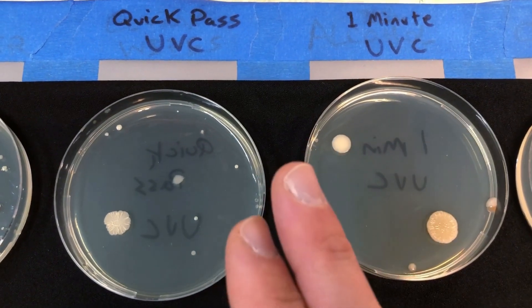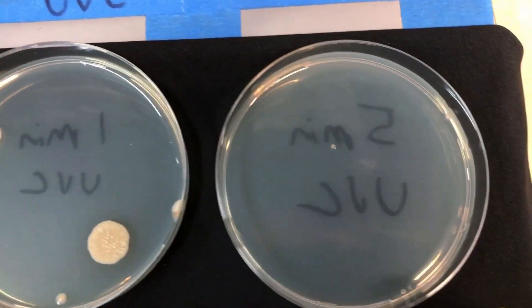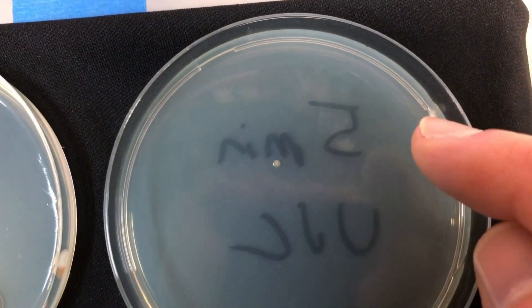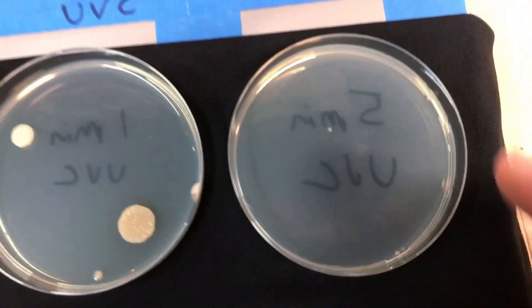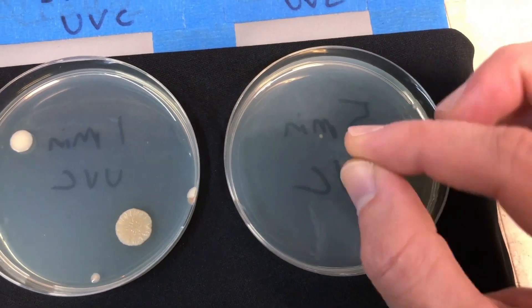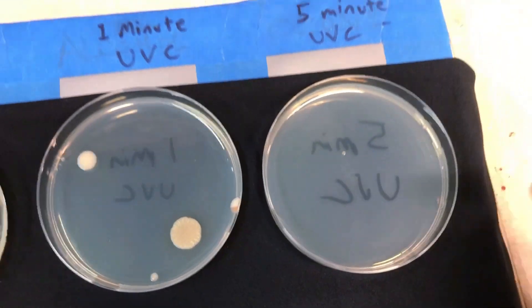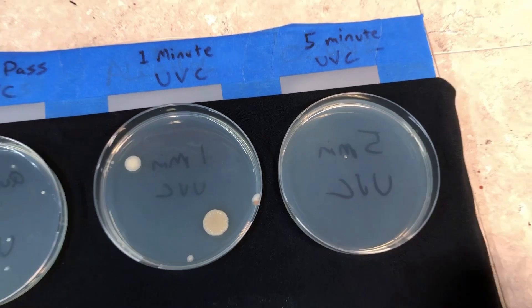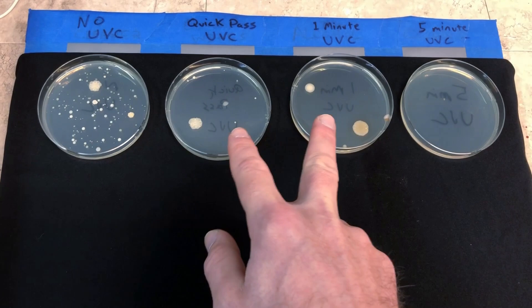The five-minute exposure at the same eight-inch distance shows just one tiny little colony. There's a little bit of mold and a tiny spot, but that could have come from the air — it's not abnormal to get a tiny speck from yeast floating around. I'd call that 99.9% sterilization or effectiveness.